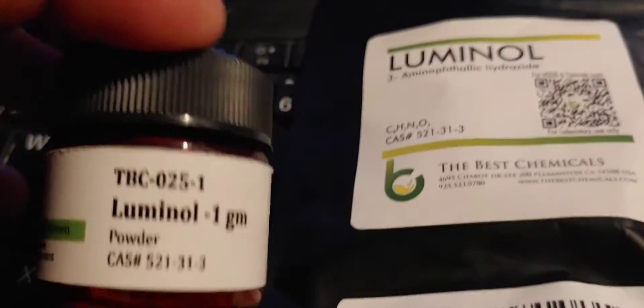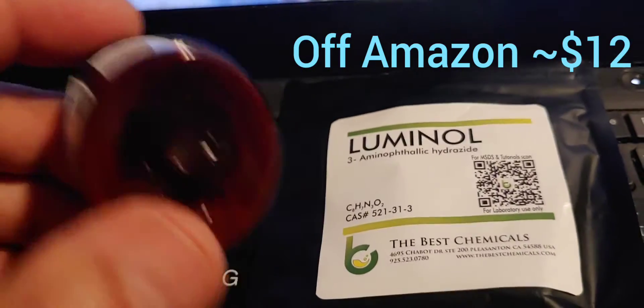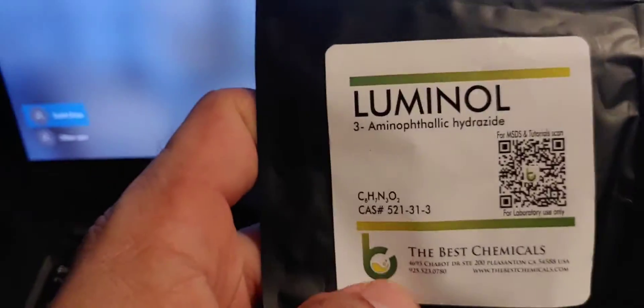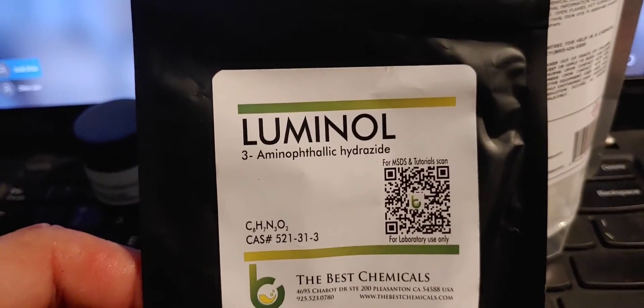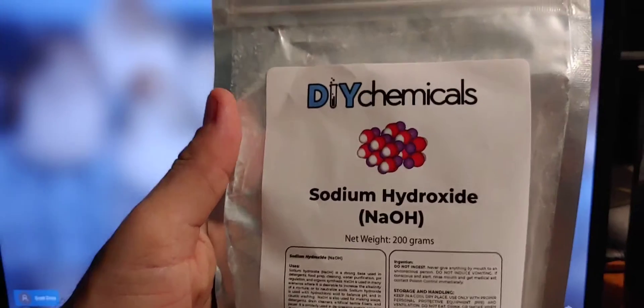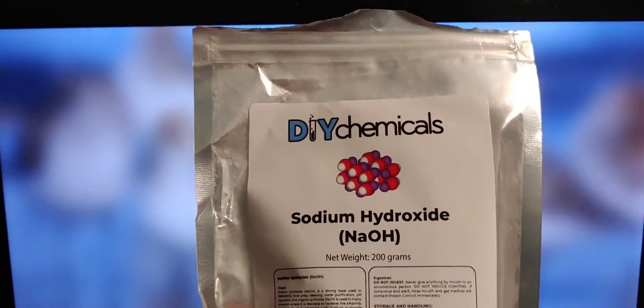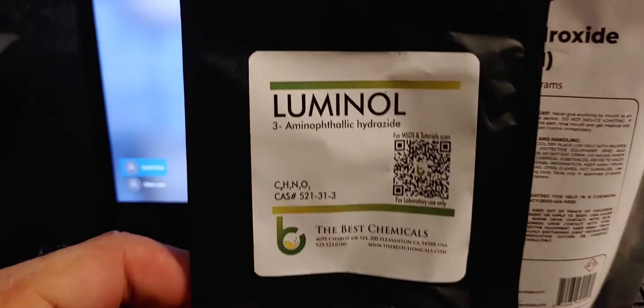We came up with the experiment and bought one gram of luminol powder. When it arrived I thought it was a really small amount, but it turns out a little bit of luminol goes a long way — one gram is plenty for any home-based tests, so don't be concerned about the quantity. We also found that luminol is not soluble in water, but it is soluble in organic solvents. So we bought lye — sodium hydroxide — and mixed it with distilled water, which gives off a little heat but makes a solution you can use to dissolve the luminol.